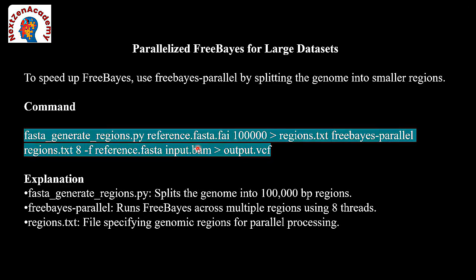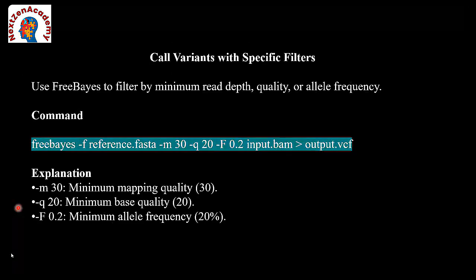We can do annotation. bcftools annotates with the dbSNP VCF with an ID, annotated VCF, filtered GVCF. A is called the annotation file. C is called IDs. We need to give the variant IDs in the column.